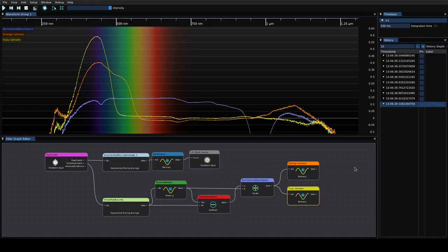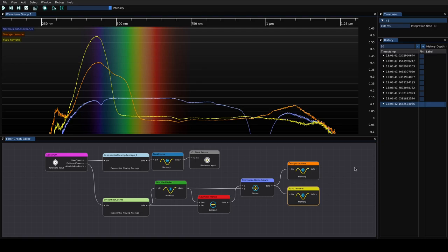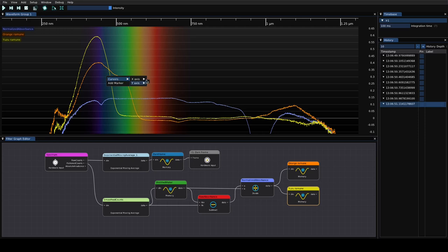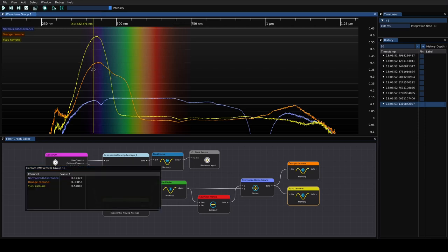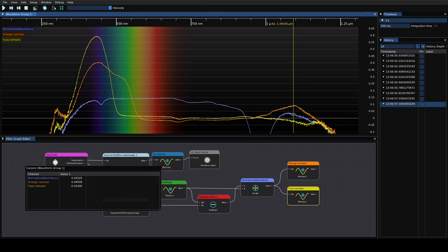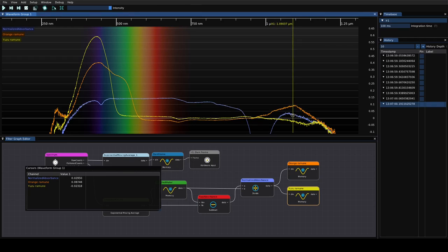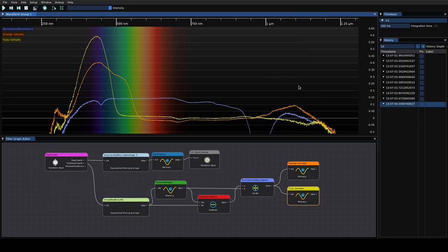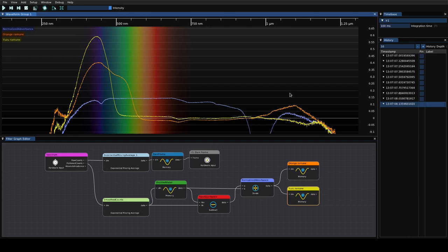So we're still rolling. I've cleaned up the mess and now let's go collect some more data. You can see now I've let the two samples sit while I had the camera off to degas fully. I collected nice clean spectra from both. We can see now that there's a very clear difference both around 431 nanometers and also into the infrared around 1090. There's a pretty big difference where the orange is a lot more absorptive in the IR than the Yuzu is. Now we're getting to the interesting part where I'm going to try and see if the lychee and the original are any different.